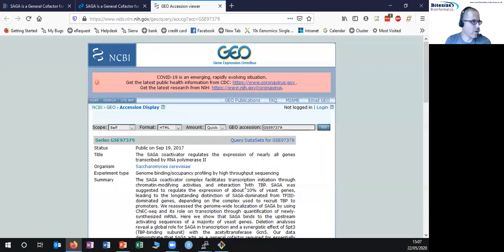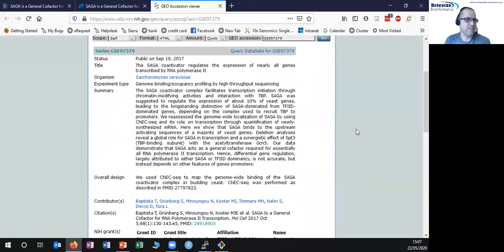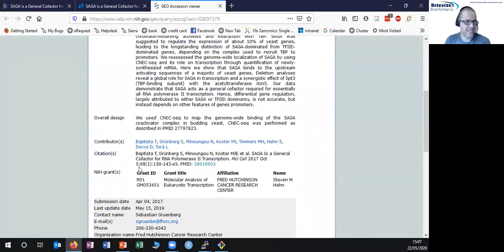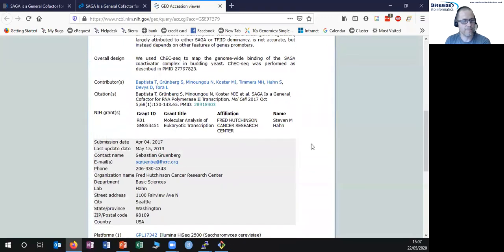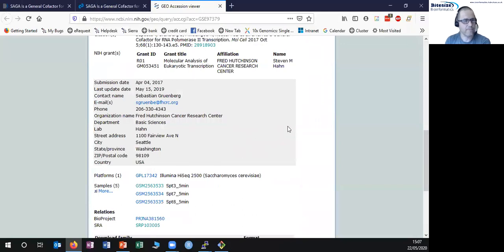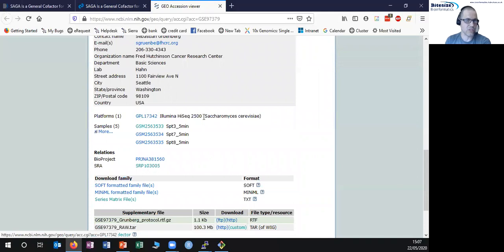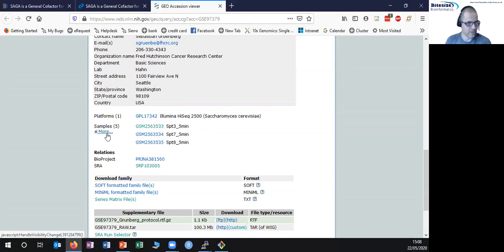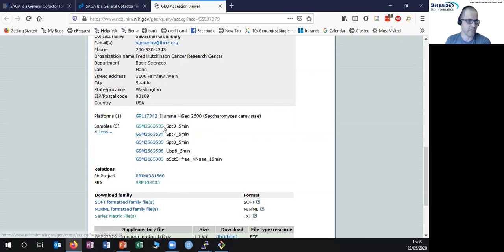This is our gateway to the data they've deposited for this paper. On the GEO project page I've got a load of metadata describing the study — the design, who did it, links back to the paper. There are details about who submitted it and when, what type of data this is — sequencing data generated on the Illumina HiSeq 2500 platform — and the list of samples they've deposited. In this particular study there are five samples.